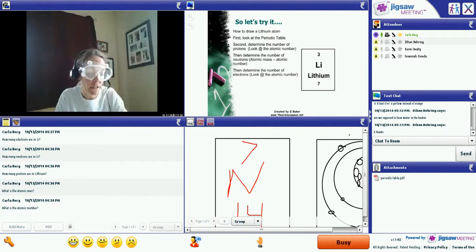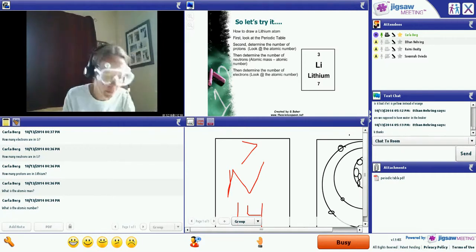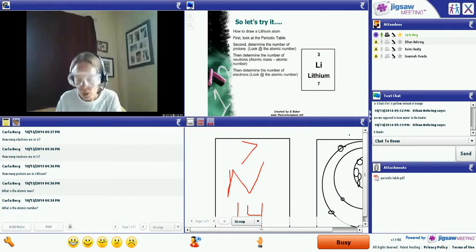Now by my watch, our first column A has been sitting for 10 minutes. So what I'd like you guys to do is go ahead and take a look at it. If you look back to our procedure on page 27, it says the relative amount of copper iodide precipitate may be more easily judged by the intensity of brown color. This is because it precipitates very slowly. So I still do not have any precipitate in any of my wells in A1.